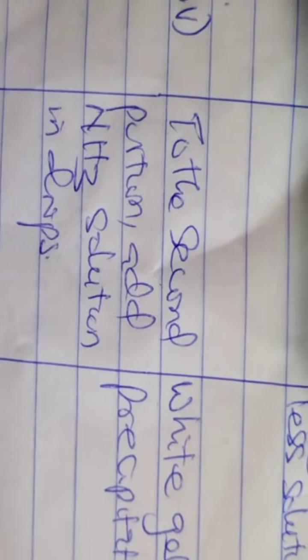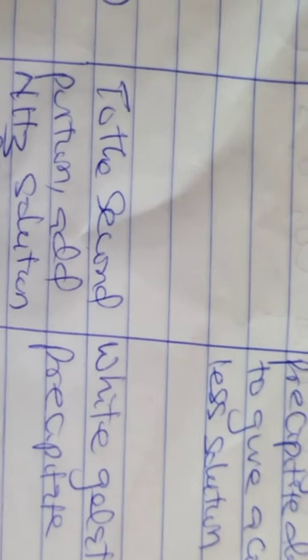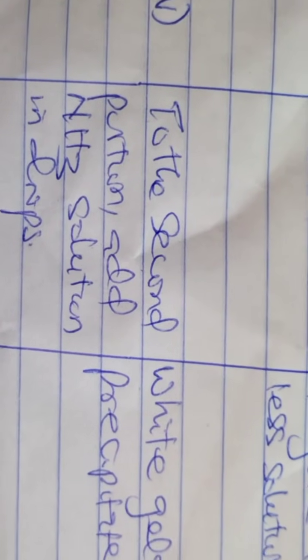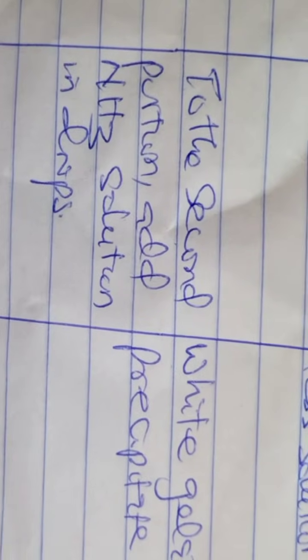Then going to IV, the second portion, add ammonia solution in drops. I repeat, IV. Second portion, add ammonia solution in drops. Observation should be white gelatinous precipitate. Then the inference also, zinc 2 ion, aluminum 3 ion present.